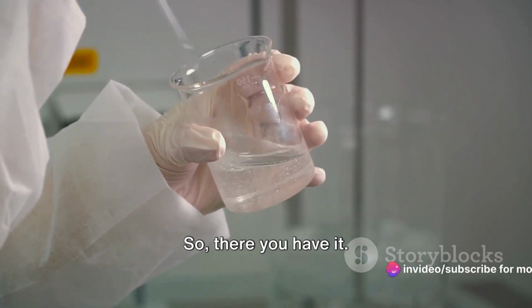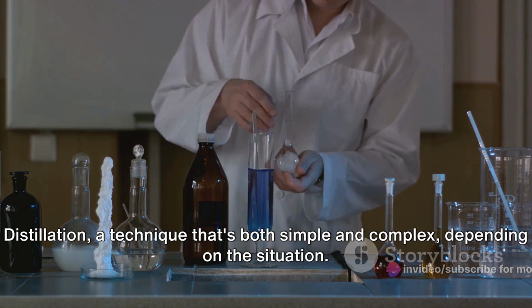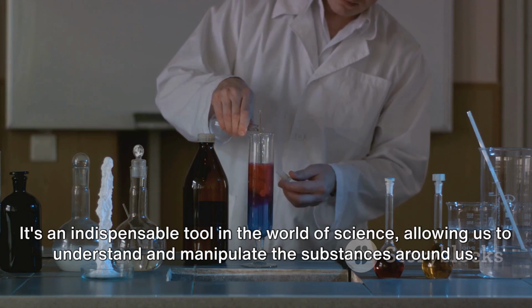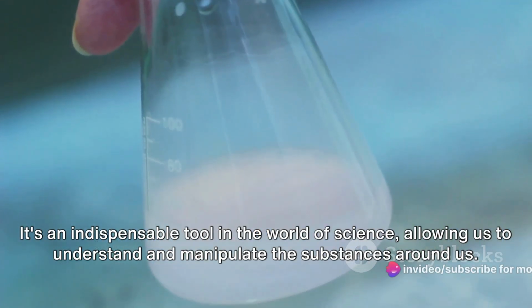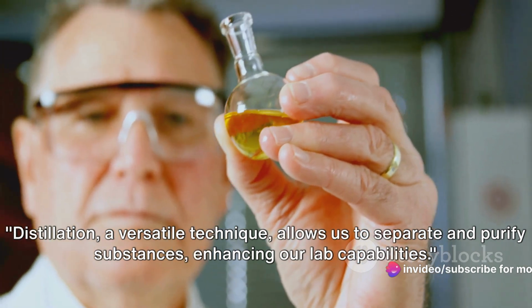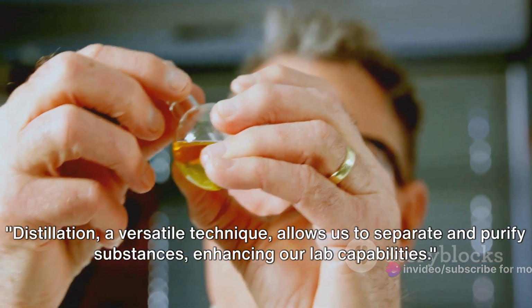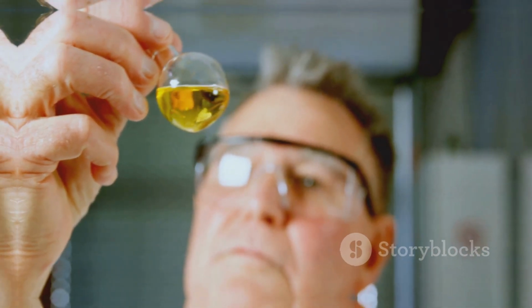So, there you have it, distillation. A technique that's both simple and complex depending on the situation. It's an indispensable tool in the world of science, allowing us to understand and manipulate the substances around us. Distillation, a versatile technique, allows us to separate and purify substances, enhancing our lab capabilities.